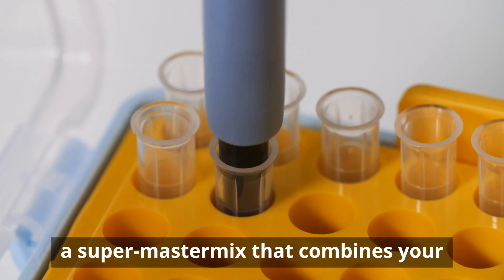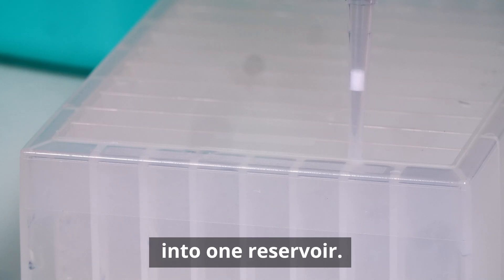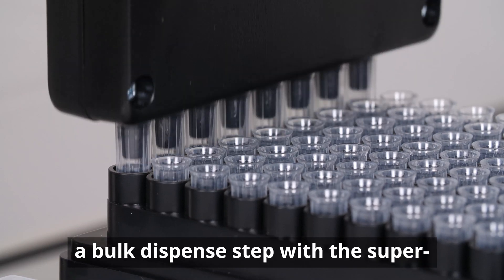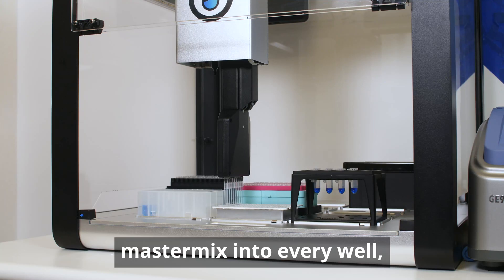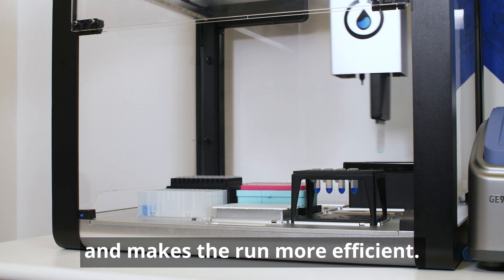The second step is to manually prepare a super master mix that combines your primers and PCR master mix into one reservoir. This allows the robot to do a bulk dispense step with the super master mix into every well, which prevents reagent waste and makes the run more efficient.